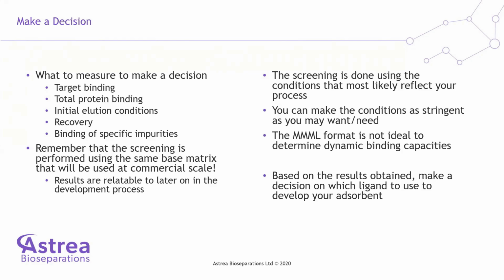So if you determine those different things is when you really can make a decision on which ligand to use to develop your adsorbent. Next one.